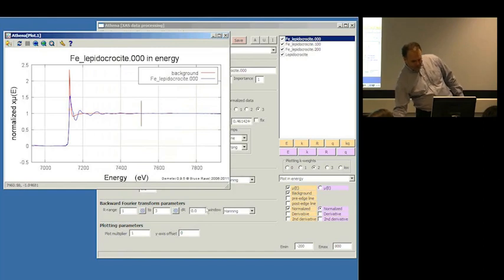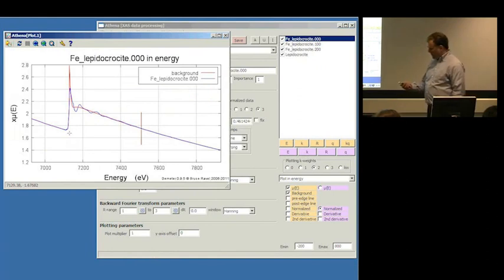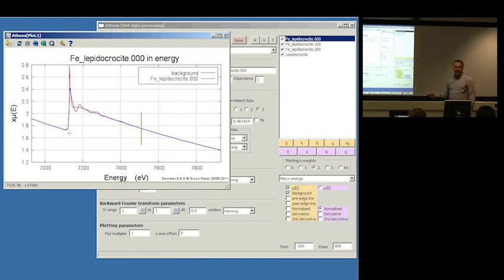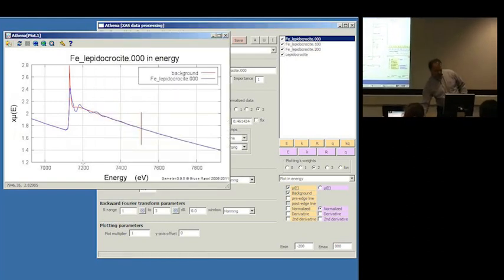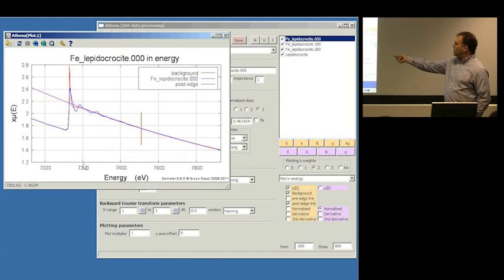The one thing we know is that when we get far enough away from the edge, the wiggles go away. So choosing this line consistently, you could almost define that well, because it should certainly follow the data nicely out here, regardless of whether this is a metal or an oxide or a sulfide or anything. The purple line should sort of just follow the data out here.